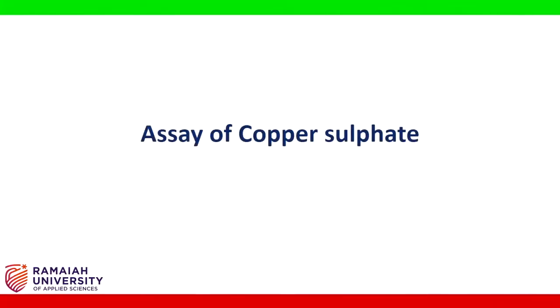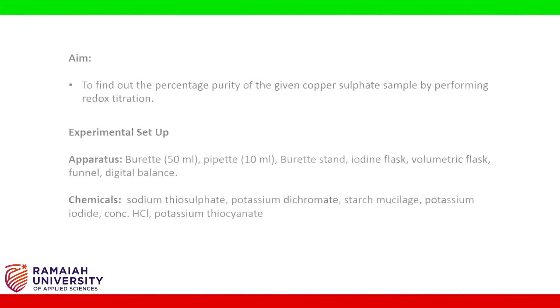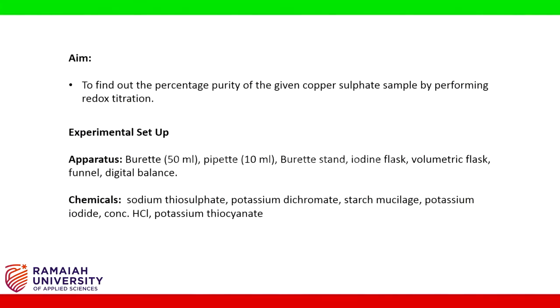Hi students, title of the experiment: Assay of copper sulphate. Aim: to find out the percentage purity of given sample of copper sulphate by performing redox titration.